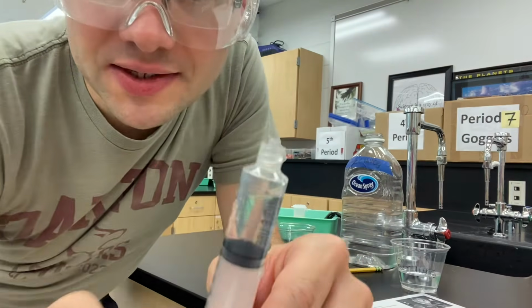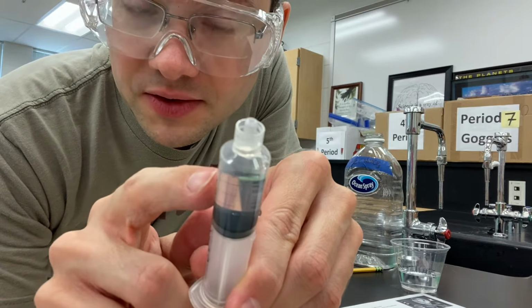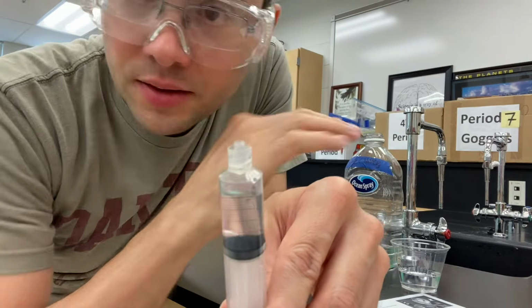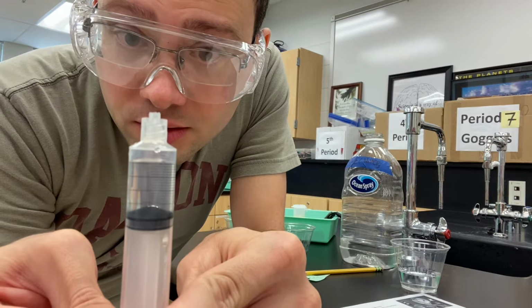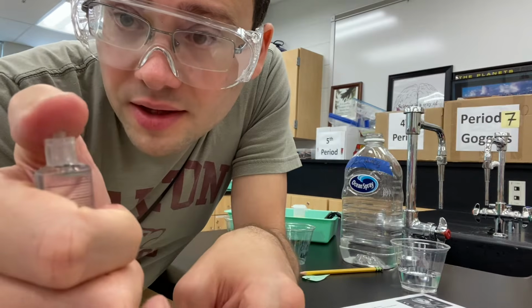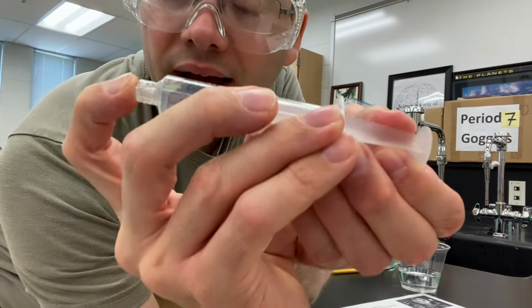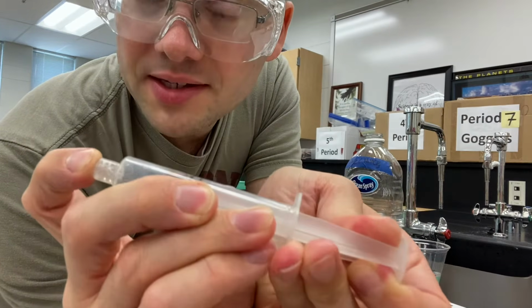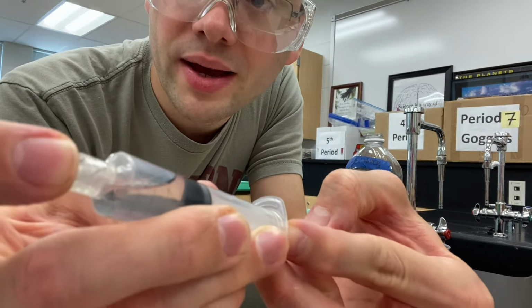And here's the tricky part. At this point, you need to get all of the air out of the spongy mesophyll in the leaf discs. And you're gonna do that by creating a vacuum. It's described in your setup, but basically, you're gonna push all of the air out to the best of your ability. Put your finger or your thumb on the top. I'll put my index finger on the top. And then pull back on the plunger, keeping your finger on the tip, making a vacuum, and it'll resist.